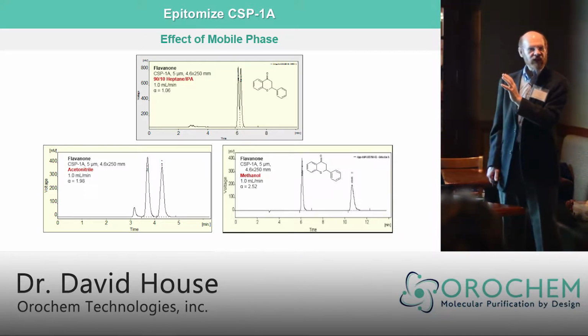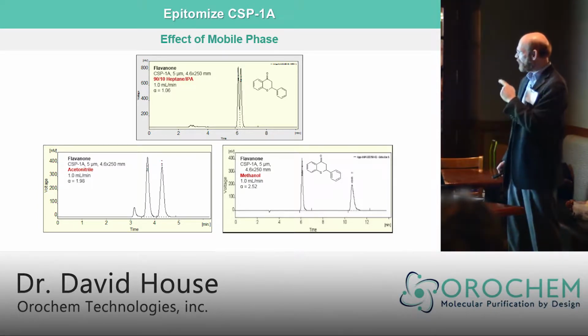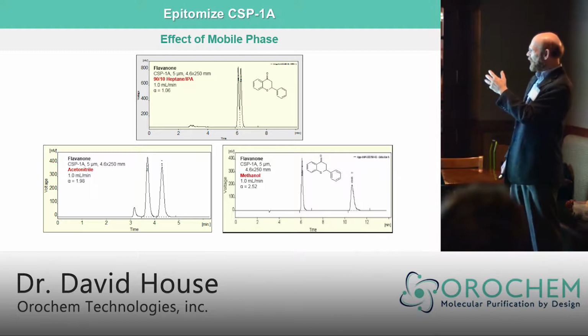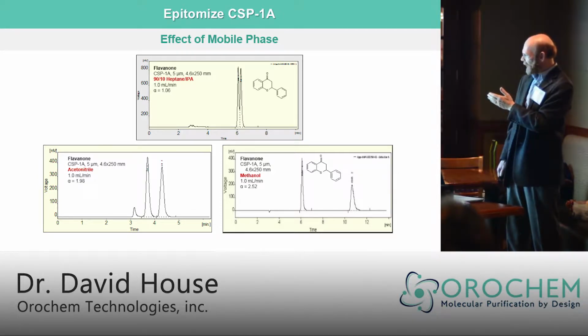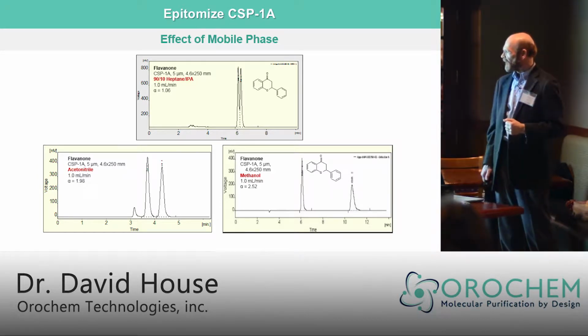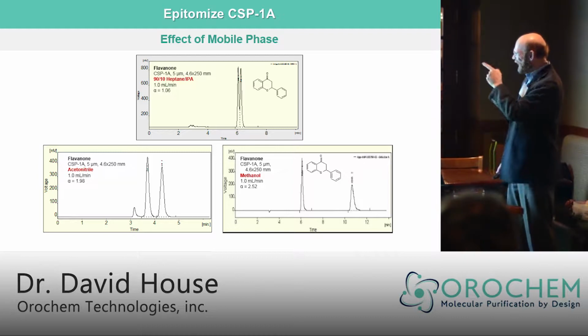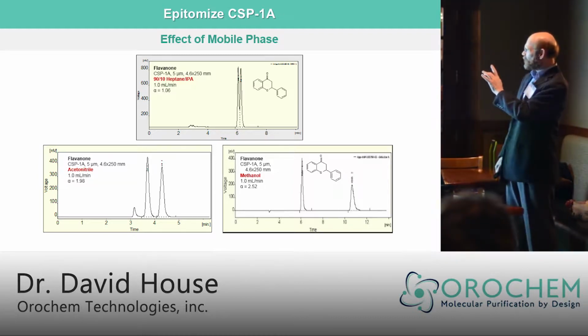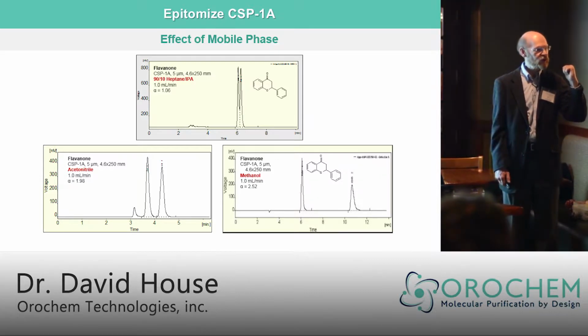Bring in exactly the same chiral stationary phase as above, and now we look at the interaction with the other optical isomer. The pi base interacts with the pi acid, no problem. The basic group of the enantiomer interacts with the acidic group of the chiral stationary phase. Again, no problem. But now we have a problem. The acidic group in this optical isomer is directed away from the chiral stationary phase.